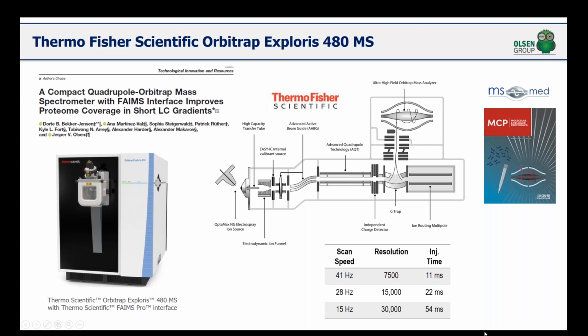All the data that I'll present today has been collected by Dorte Becker Jensen and Anna Martinez del Val from the lab, as part of this collaboration with Thermo Fisher.